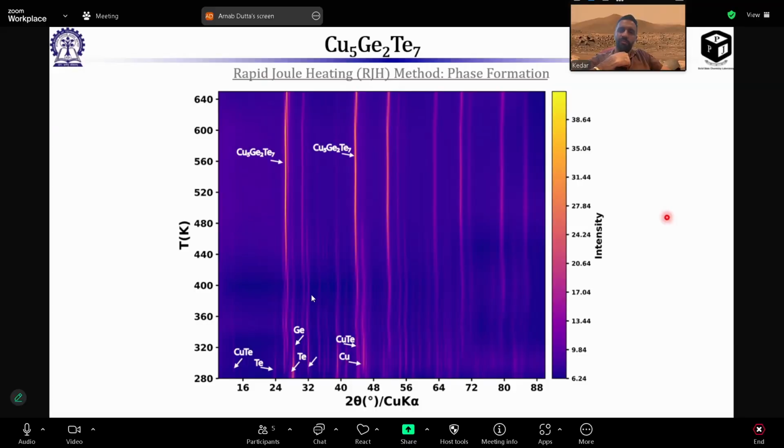Not required. No, not at all, because we already have the model from single crystal XRD, and we have checked the data we have got, and we did the detailed refinement. So we have checked the atom fit as well. So it's perfect, with a residual factor of 5%, 6%. So it's really great actually. That's really exciting.